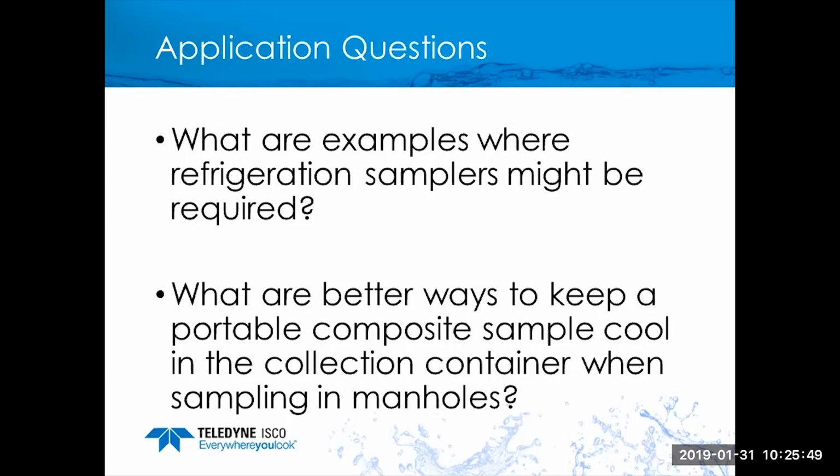Don't place the sampler near any sources of elevated heat, like an exhaust vent, or right near an air conditioning unit where you have a lot of hot air being blown out. If the sampler is placed within an enclosure of some sort, ensure there's some ventilation. Allow the air to pass through and allow the heat to escape rather than build up.